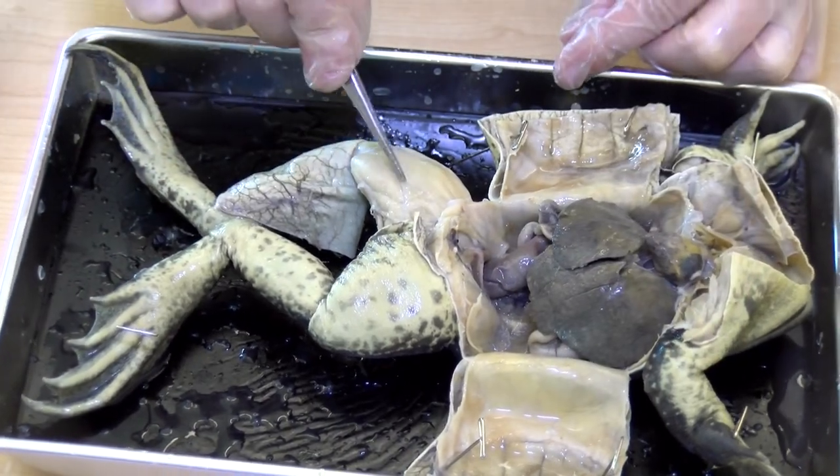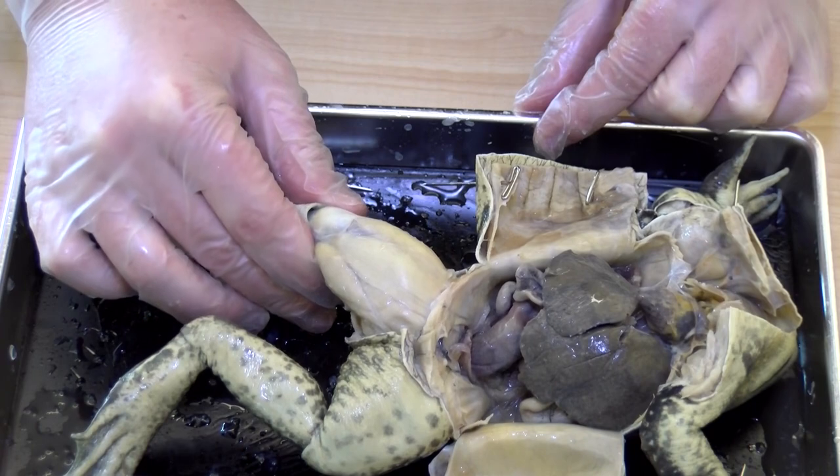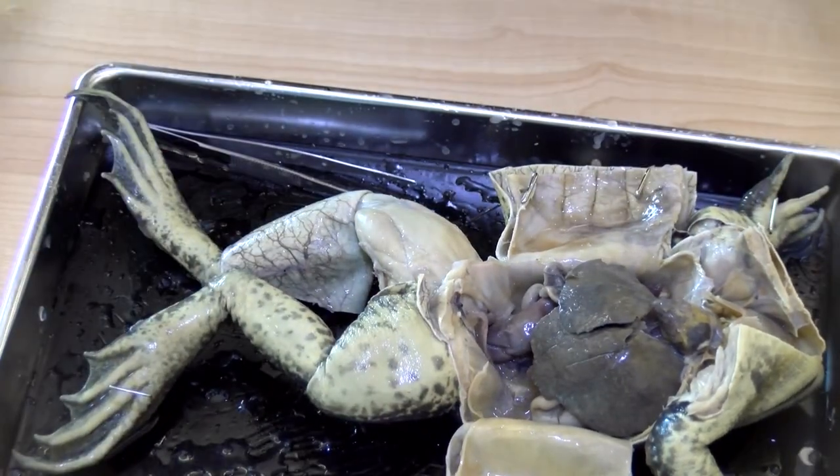That's so cool — look at that. It's quite muscly. Yeah, they have to be — they're little swimmers.